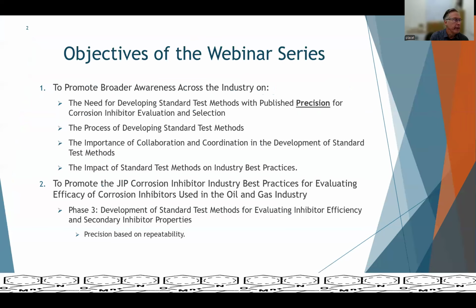So go ahead and advance the slide. What we're trying to do with this webinar series is gain consensus of thought in the need for establishing standard test methods. And we want to really underscore the importance of this published precision. Now, if you're old like me and Joe on the call, you might have been raised to think that precision was the number of decimal places in a laboratory evaluation. But ASTM and ISO have got behind their definition of precision now, which is really repeatability and reproducibility of a test method.